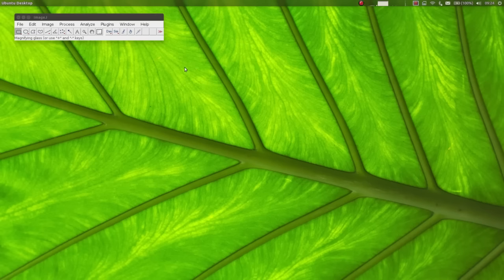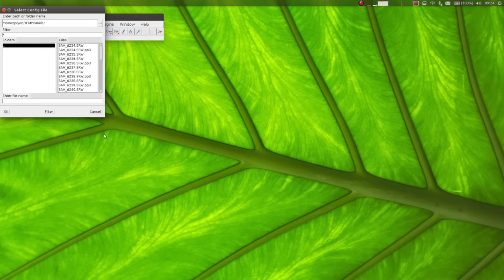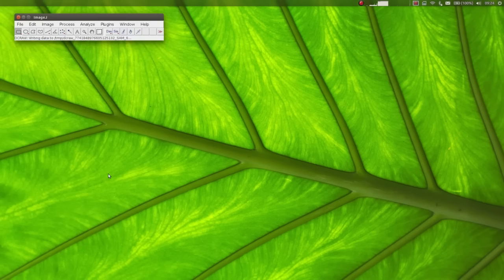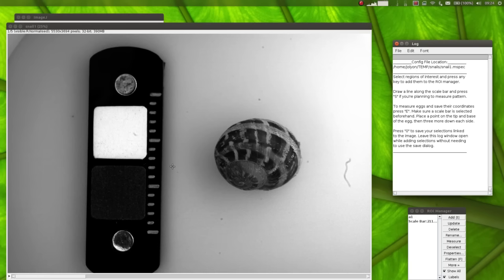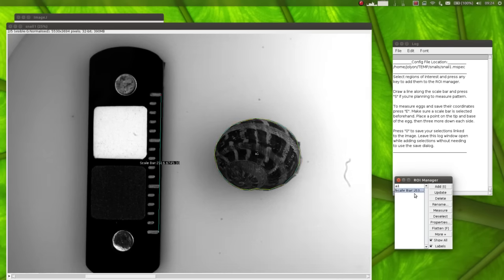In order to reload a multispectral image, you just need to go Plugins, Multispectral Imaging, and Load Multispectral Image. Then select the file that you want to load. So if I load up the snail here, you'll see that this has loaded a normalized image, and the selections we've made are available in the ROI manager.